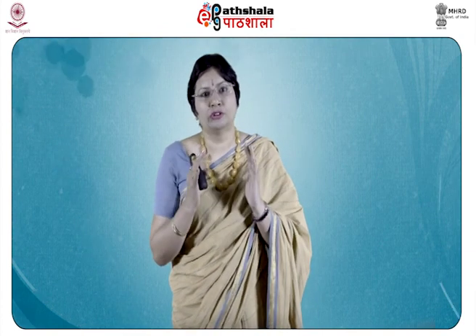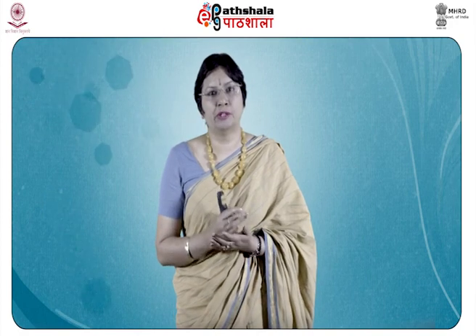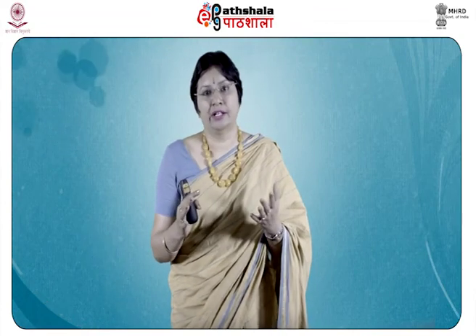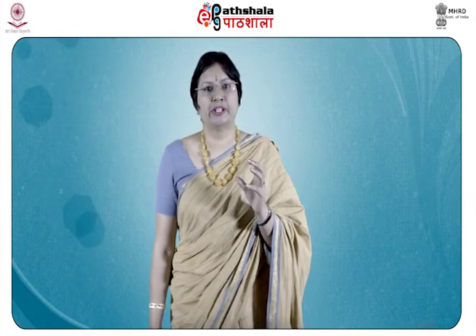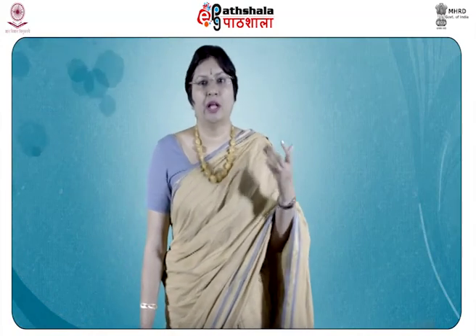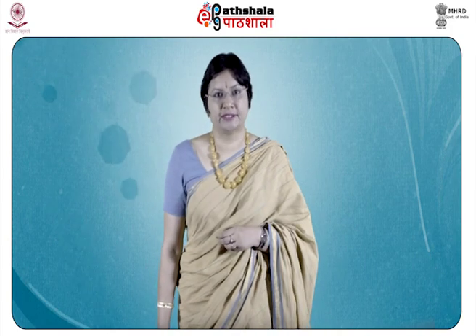In addition, we also studied how the flame test for sodium, potassium, calcium, barium, strontium will give corresponding colors in flame, that is, golden yellow for sodium, violet for potassium, crimson for strontium and so on for detecting these cations.